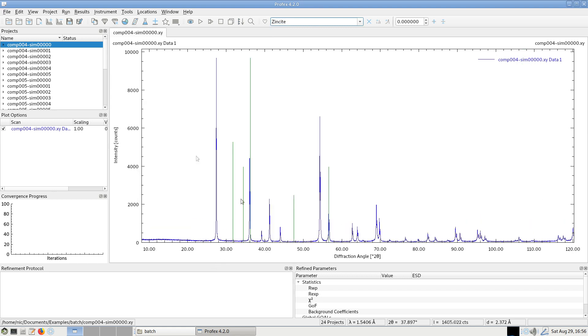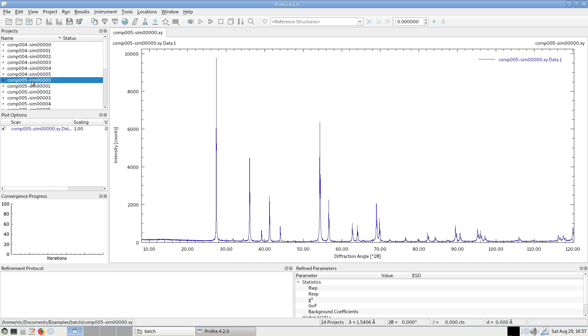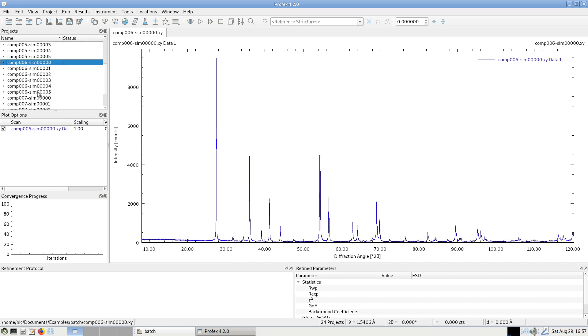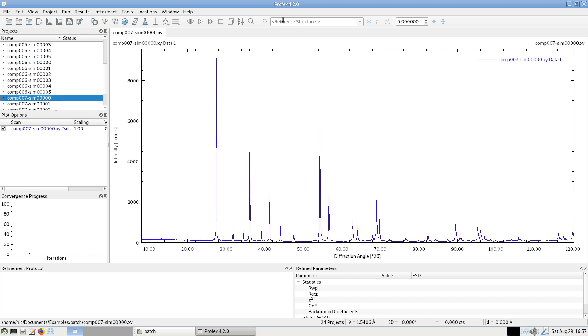And if I go to the next composition, this was composition number four, I go to composition five, six and seven, you can see that the zincite signal increases. So this is a series of rutile matrix and increasing contents of zincite.